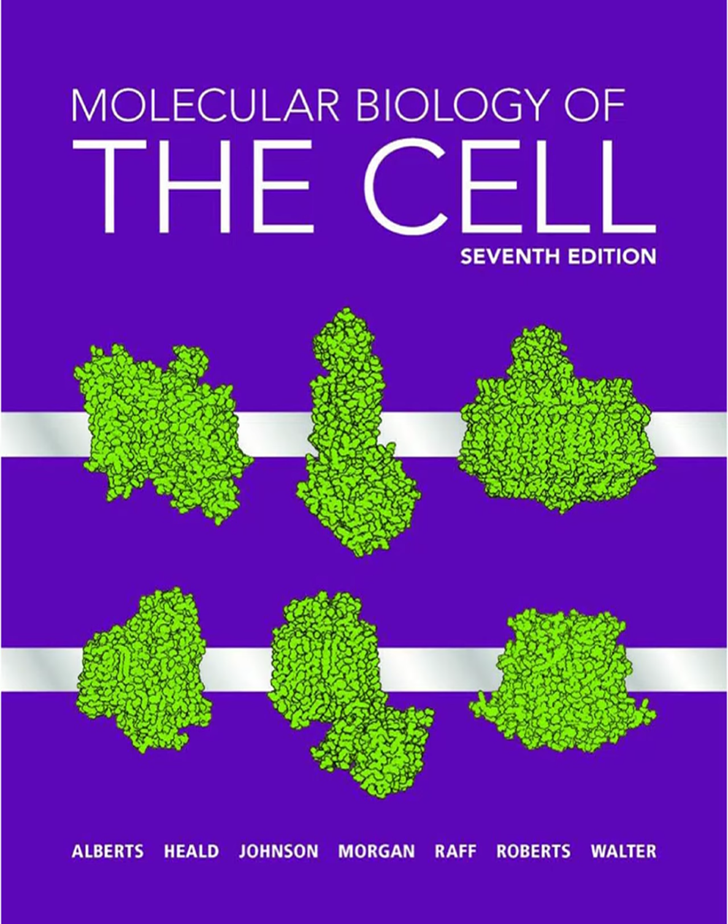A typical animal cell is only about 10 to 20 micrometers across. That's a fraction of a human hair's width. Tiny. Far too small for the naked eye. And on top of that, most cells are basically colorless and translucent. It's like trying to see details in clear jello. So early microscopists had to get clever, using stains to add some contrast. Exactly. Anything to make things stand out. And that challenge of scale is still central today.